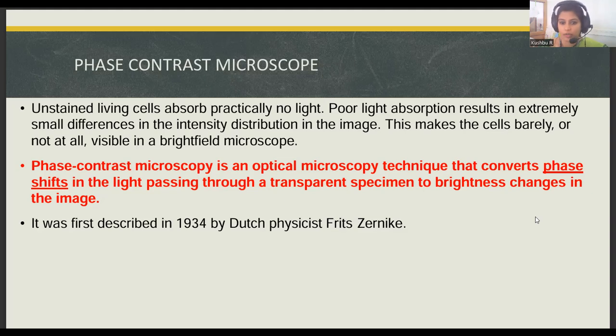The phase contrast microscope is an optical microscope which helps us to study the specimen without it being stained, in its transparent form itself, with the help of light. Here, a phase shift is created by the lenses that are inbuilt in the phase contrast microscope, which enables us to study the transparent specimen by changing the brightness at varied positions.